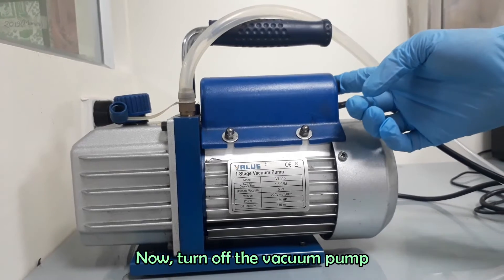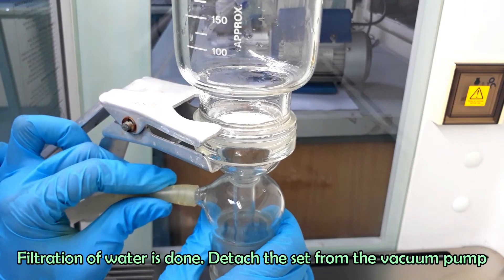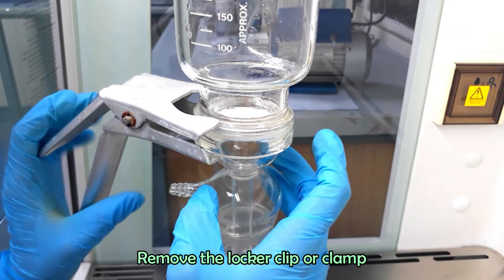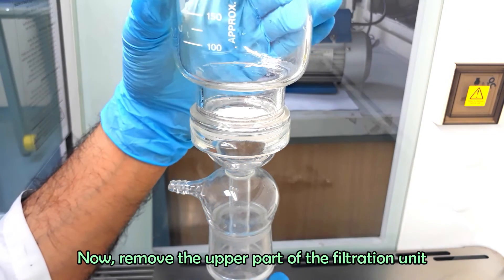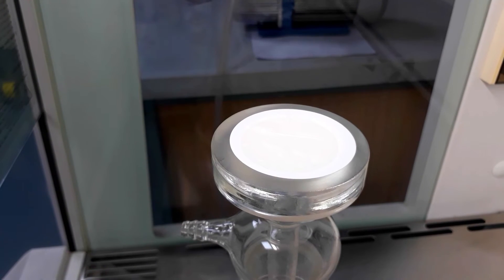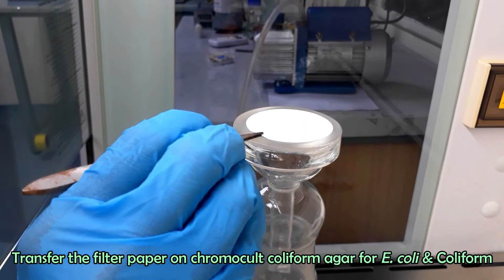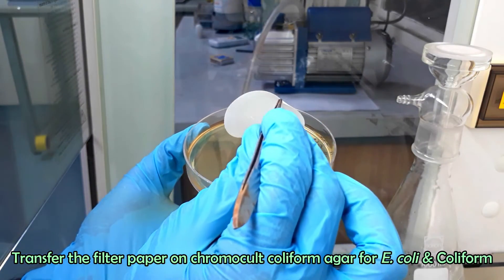Now turn off the vacuum pump and detach it. Remove the locker clamp and remove the funnel of the filtration unit. You can see the filter paper on the center of the middle part. Transfer the filter paper onto the chromocult coliform agar for E. coli and coliform. Do not invert the filter paper during transfer — the filter side should remain upper side without touching the media.